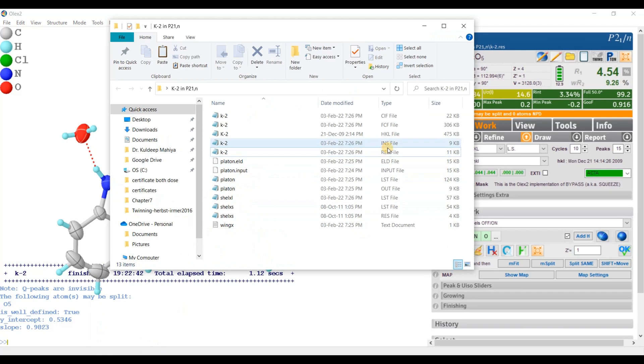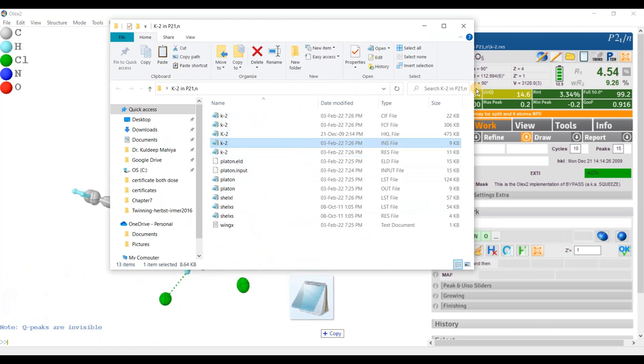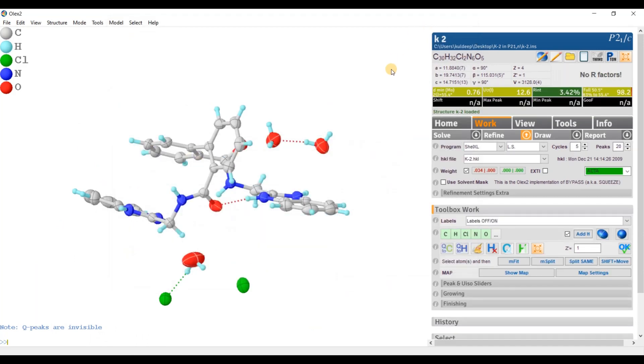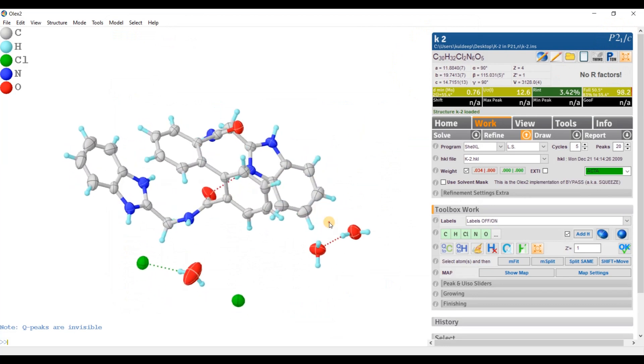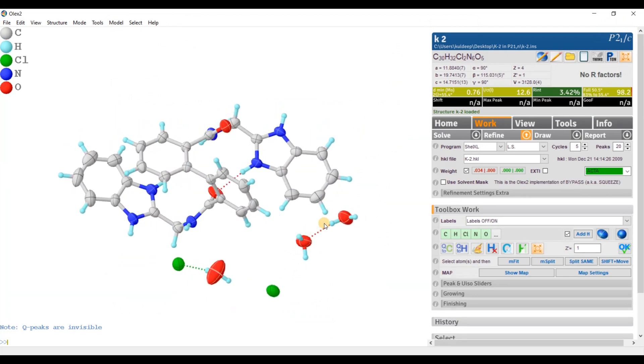Now the INS, drag here. And now I have my structure in P21/c. Everything looking nice. Let's refine one more time.